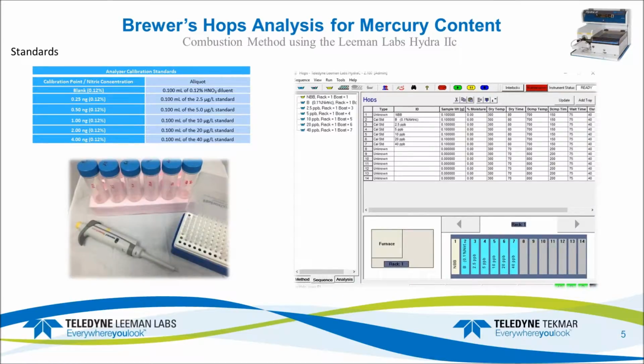Standardization is just very simply, I create some liquid standards. You can also use solid reference materials of a specified concentration to set up the system. I went with liquids. I created concentrations in a particular range, and the final range I have here on the left side were my actual standards that I used. Those are injected into the system one by one in an automated fashion, and it develops a curve of the mass versus the response, or the microabsorbance in this case.